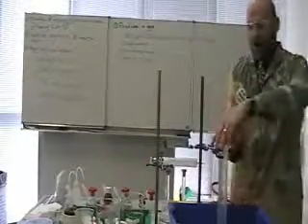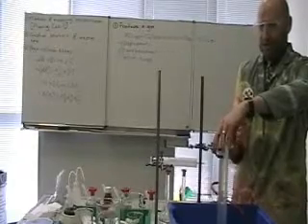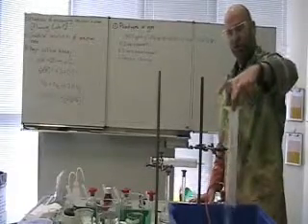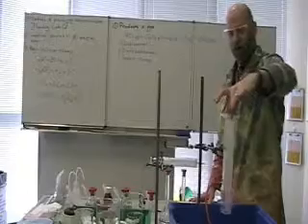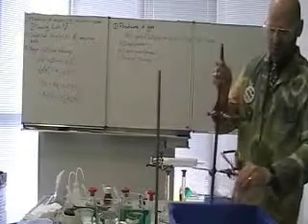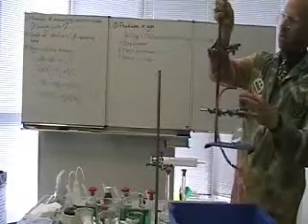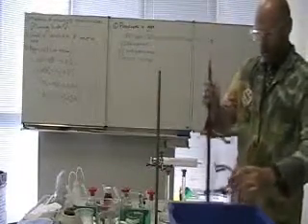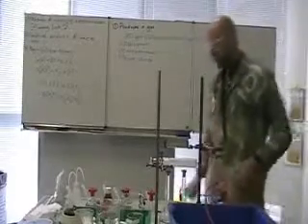All right, so as an example, how would you do that? I'll give you the displacement ones first. This is a displacement apparatus right here. I've got it already set up, but I'm going to show you how I set it up. What I've got is a measuring cylinder, which is full of water, and the water will be displaced by the gas. I've also got a conical flask, a bung, glass tube, and rubber tubing to connect.